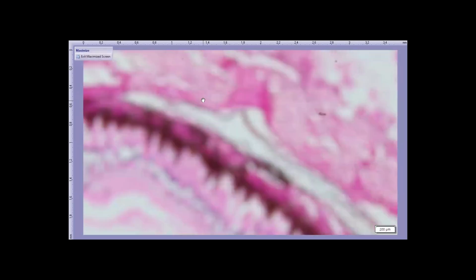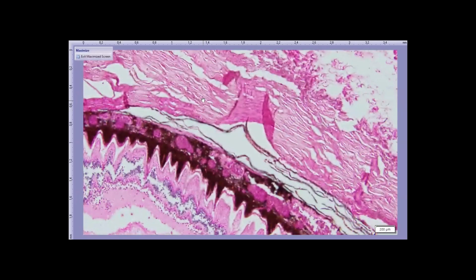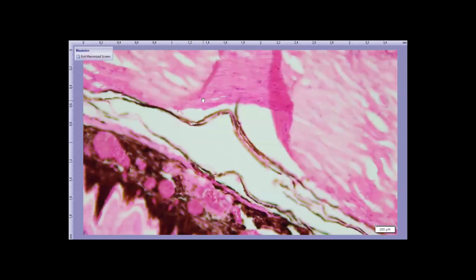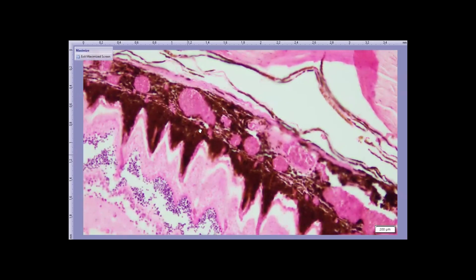I'm not going to be able to show you in this specimen, but the fruit bat has a tapetum. It has a retinal tapetum, even though it isn't obvious in this specimen. If we look at the retina, the pigment in these hillocks is all choroidal. It's not in the retinal pigment epithelium. Here's the retinal pigment epithelium.